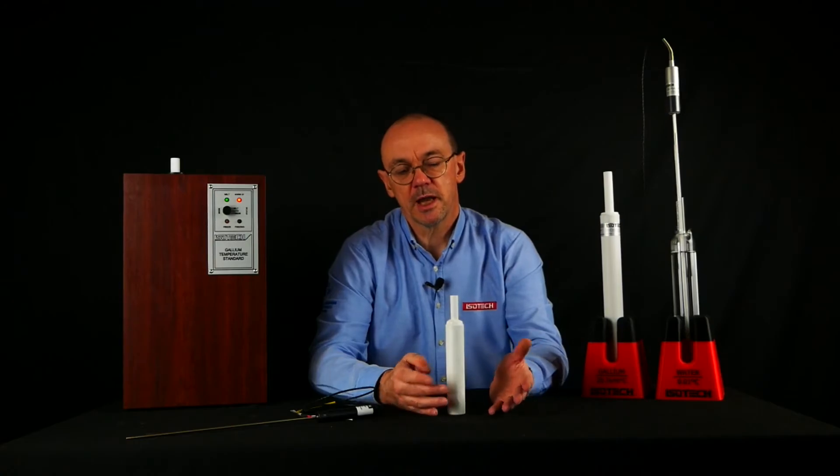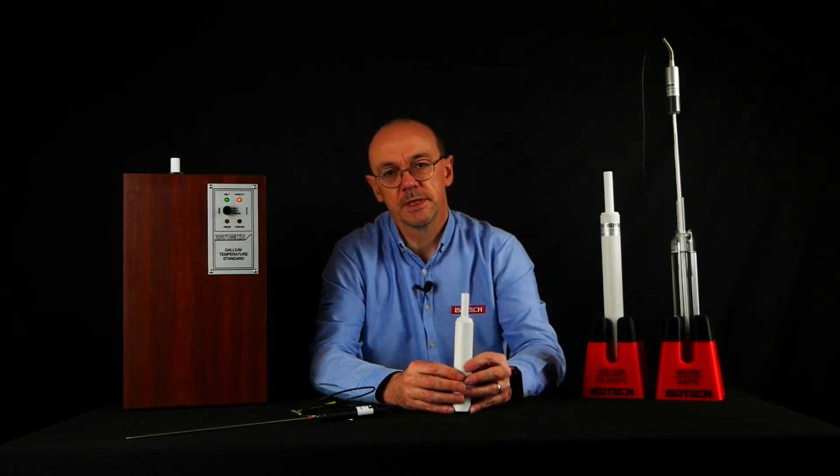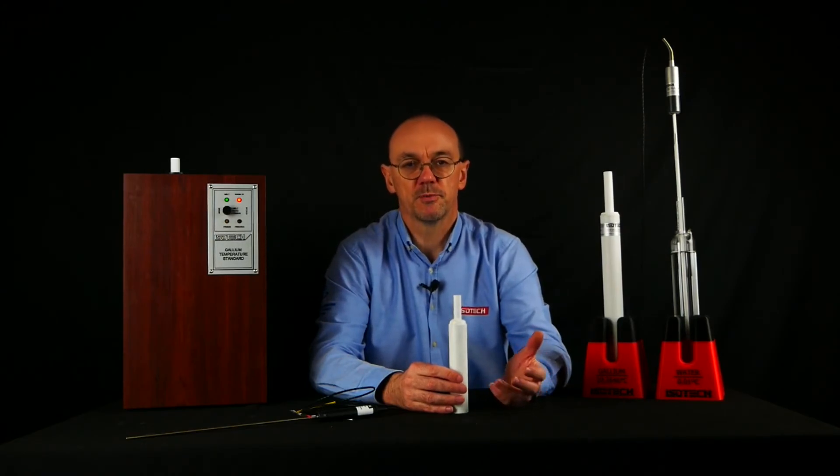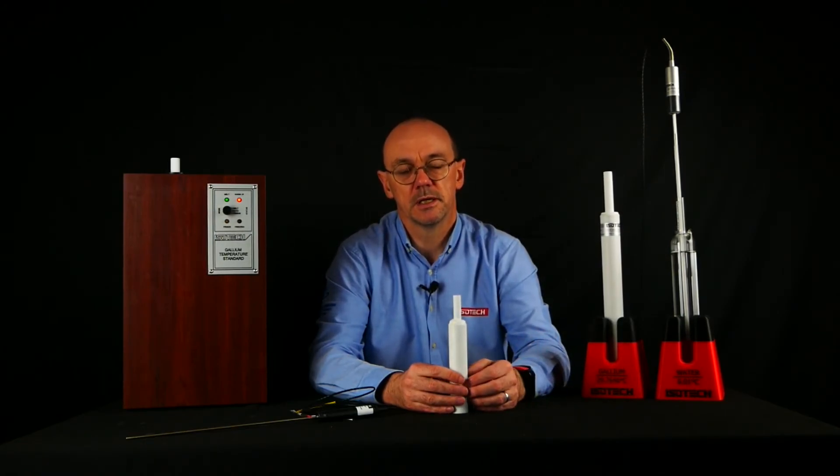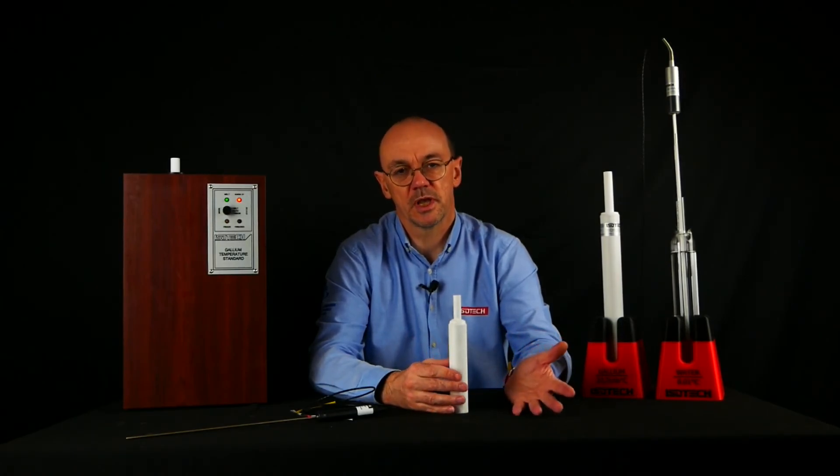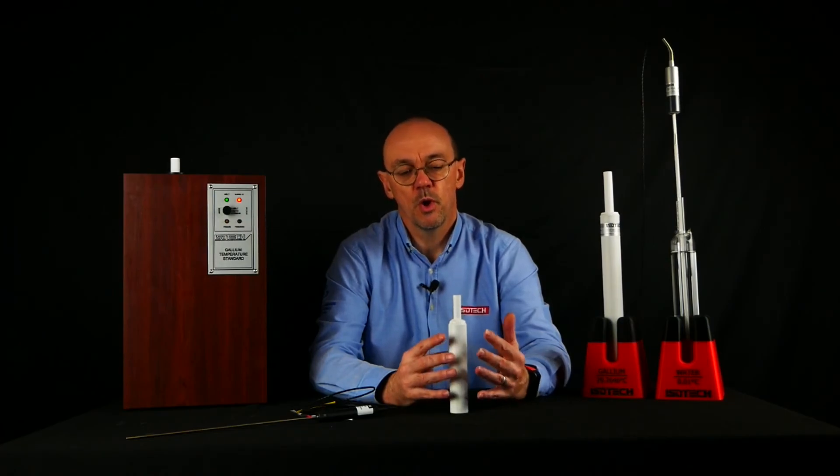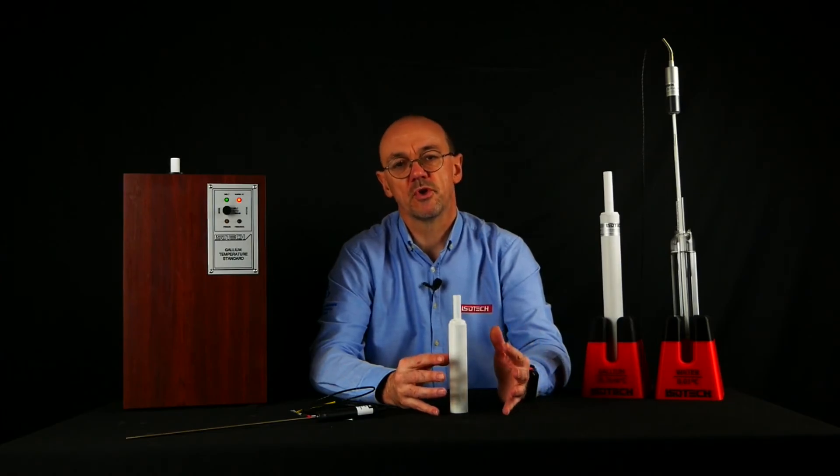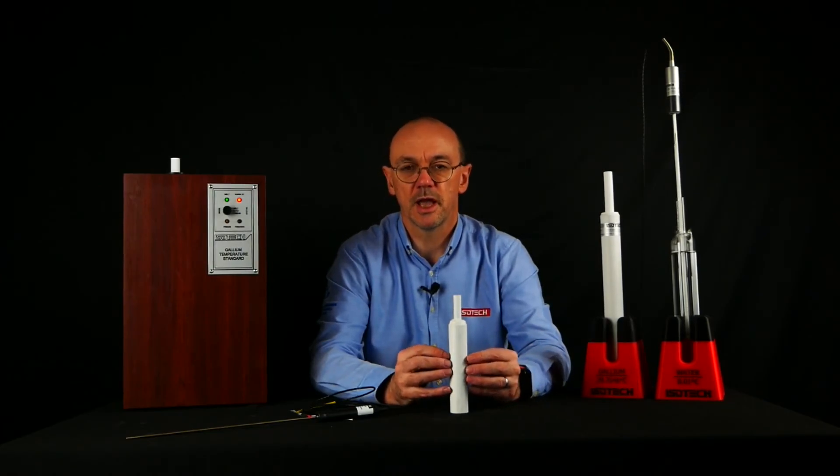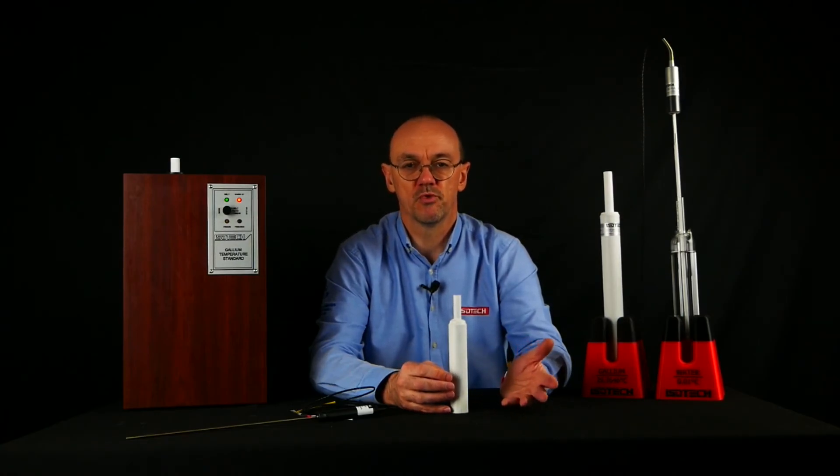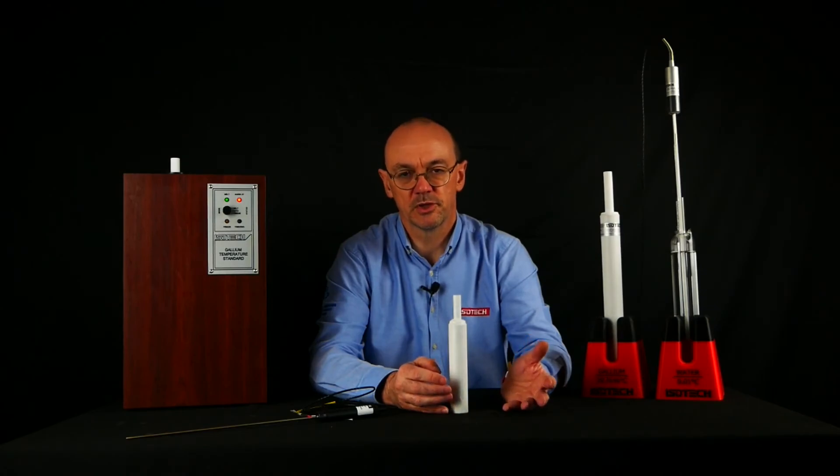The big thing to know about gallium cells is that gallium is considered hazardous, particularly when it's been shipped on an aircraft. Special regulations apply because liquid gallium will dissolve aluminum, which is a risk to the aircraft. So when a gallium cell is shipped on an aircraft, it has to be packed in dry ice to be sure that the gallium is in its solid phase. Other restrictions apply when it's shipped by road, but there are still regulations, and it's important to follow those.